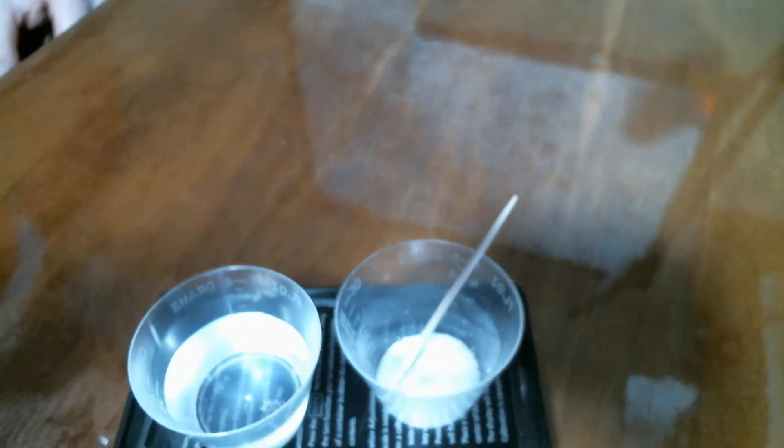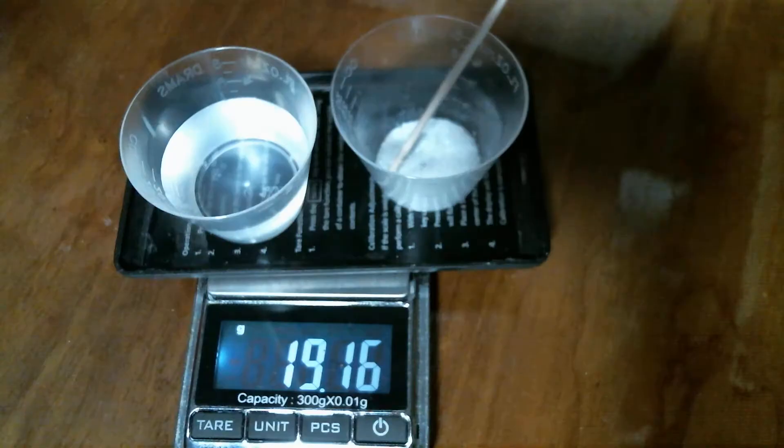Let's move that a little bit closer so you can actually see the full decimal point. 19.16 grams.